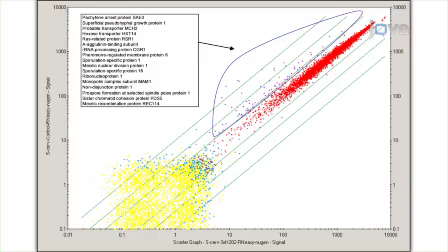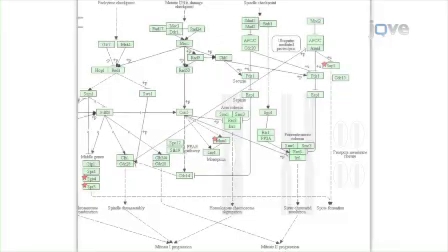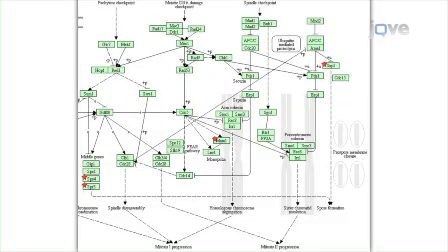Genes colored in purple indicate genes that are differentially expressed, while genes colored in red are not. In this example, most of the differentially expressed genes are those involved in cell cycle control, as indicated by their descriptions. This flowchart from the Database for Annotation, Visualization, and Integrated Discovery illustrates differentially expressed genes in an affected biological pathway. The genes indicated with a red star indicate the downregulated genes in the meiotic pathway.